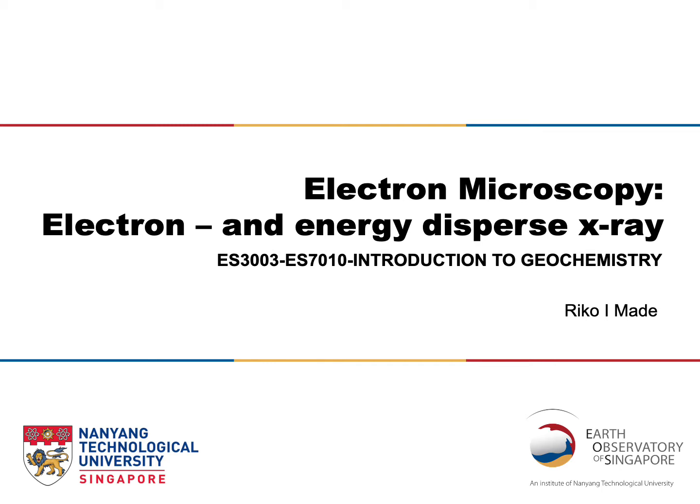In today's tutorial we will be talking about electron microscopy, and thus the electron and the interaction with the material that produce the energy in terms of photon, which we're going to use in the energy dispersive X-ray technique.